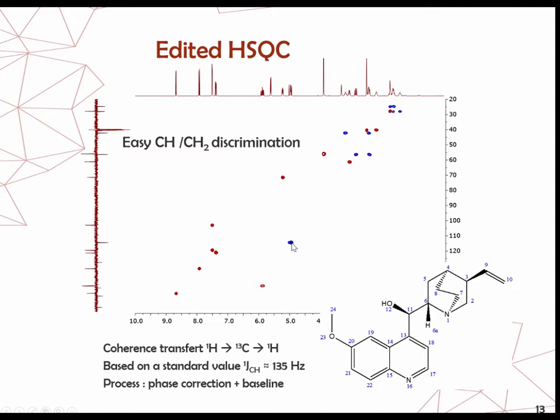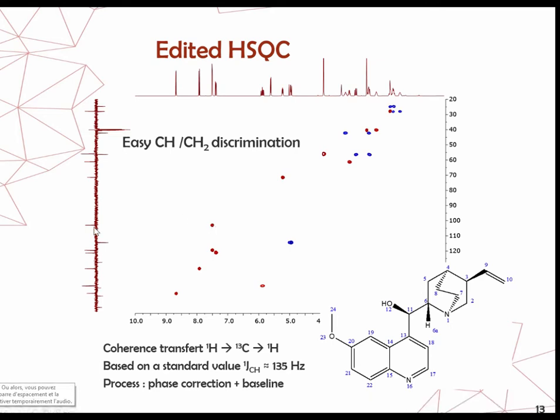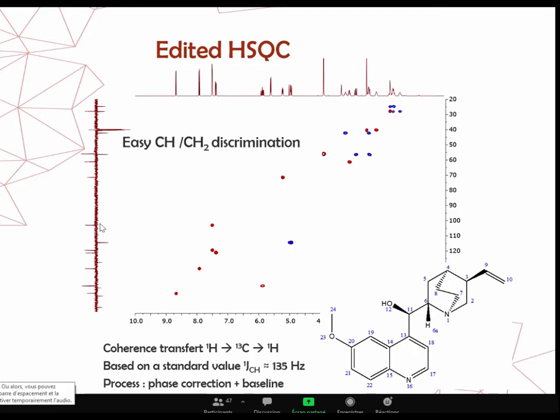This is the same as DEPT information. And you will get the correlation between proton signal and carbon signal, and you will know which proton is related to which carbon.